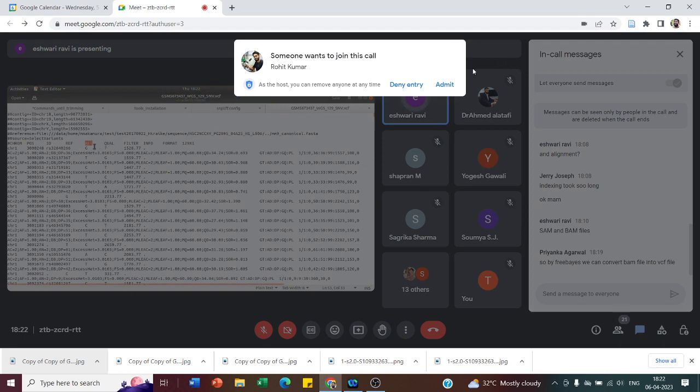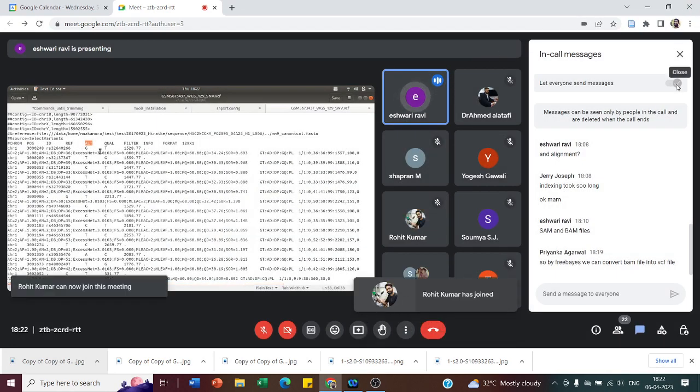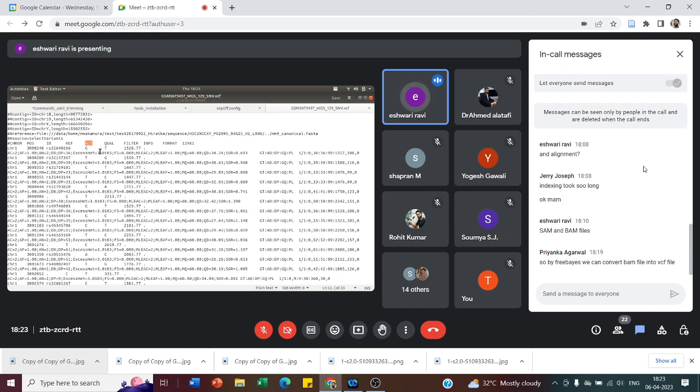sample nucleotide. So what basically the variant calling file will do is, it will take your sample file, and it will compare, and it will map with the coordinates of your aligned BAM file, and it will give you a table like this, which mentions your alternative, meaning your sample's nucleotide, and this is your reference genome file.